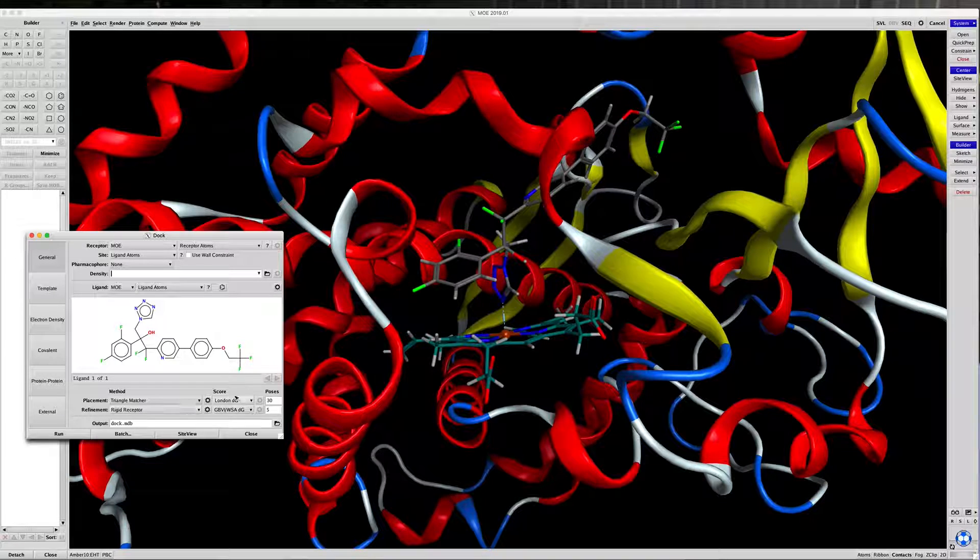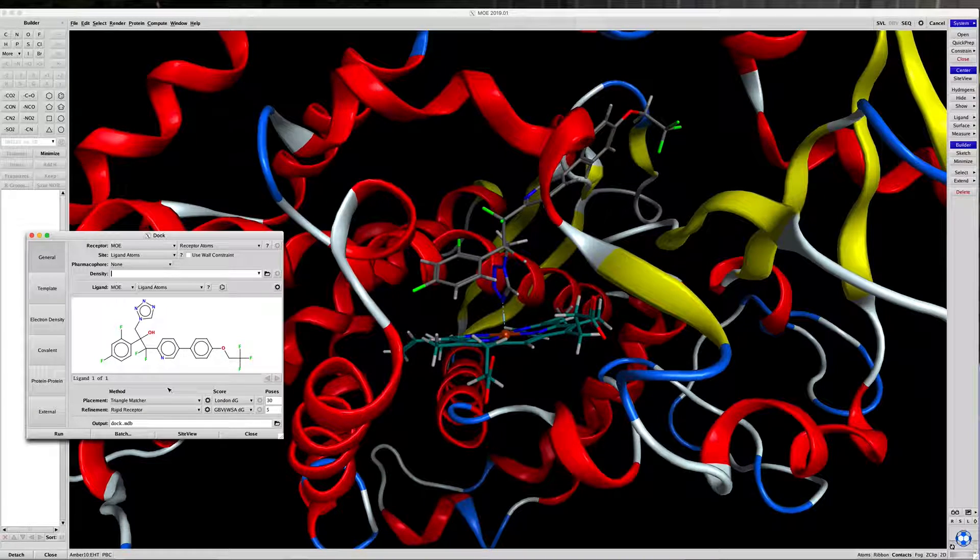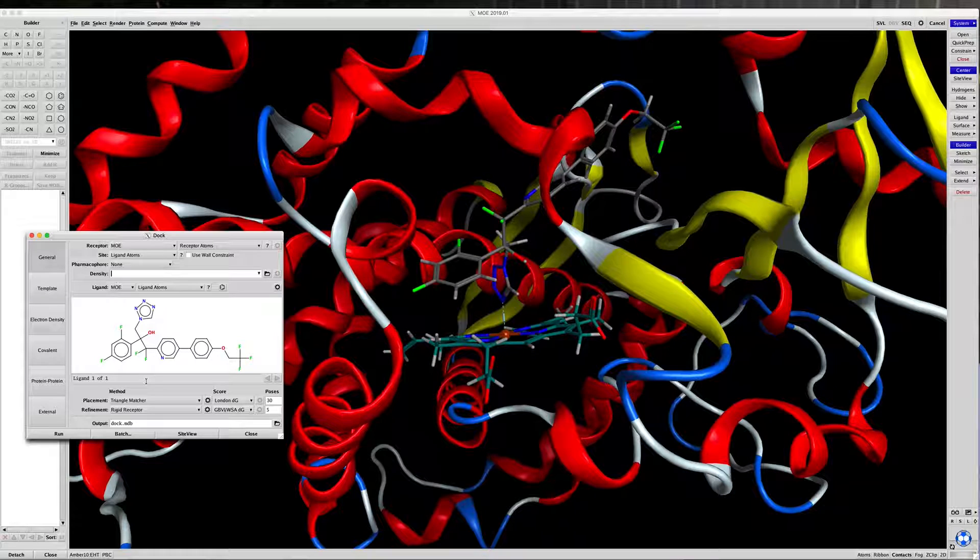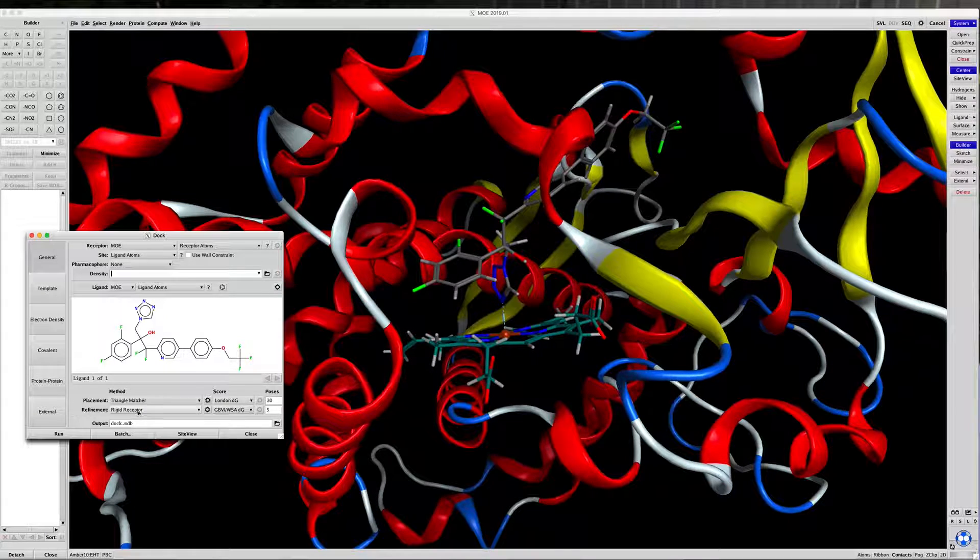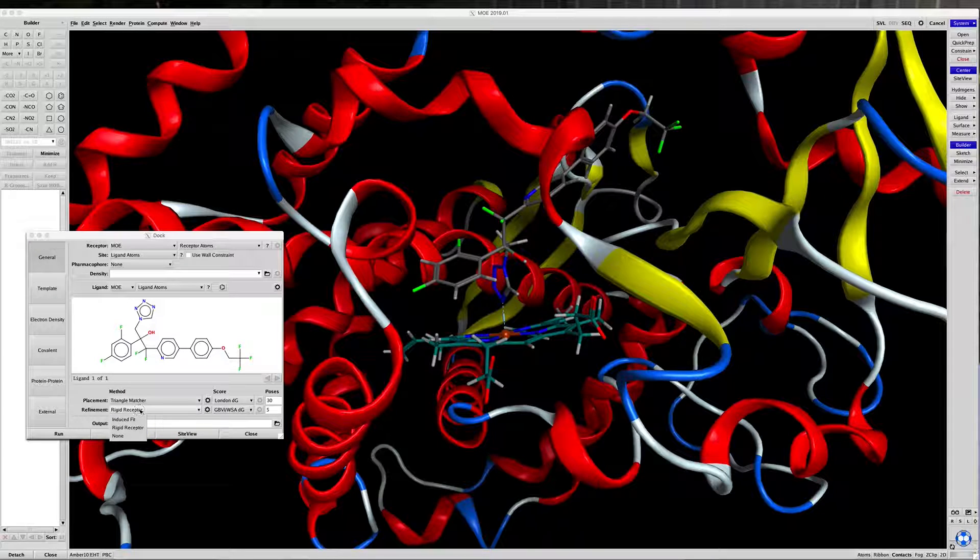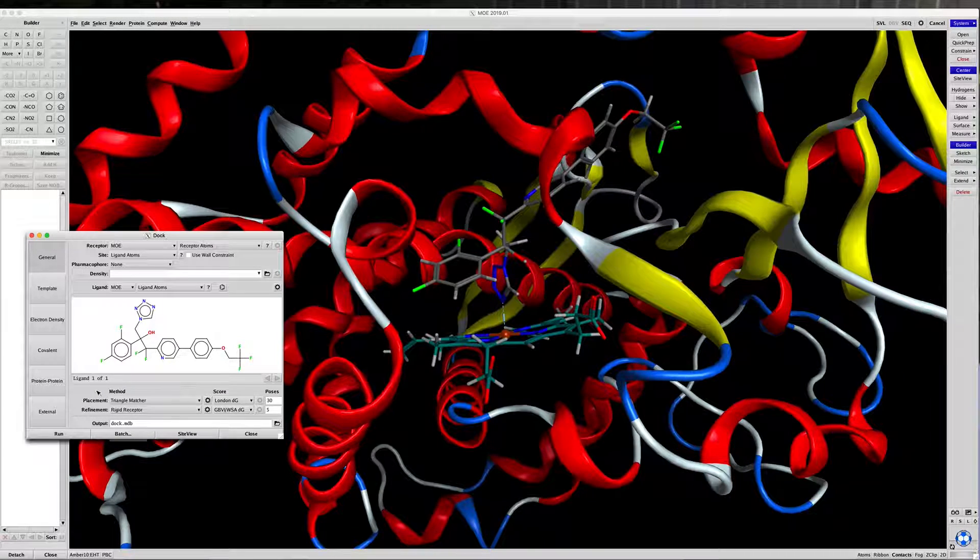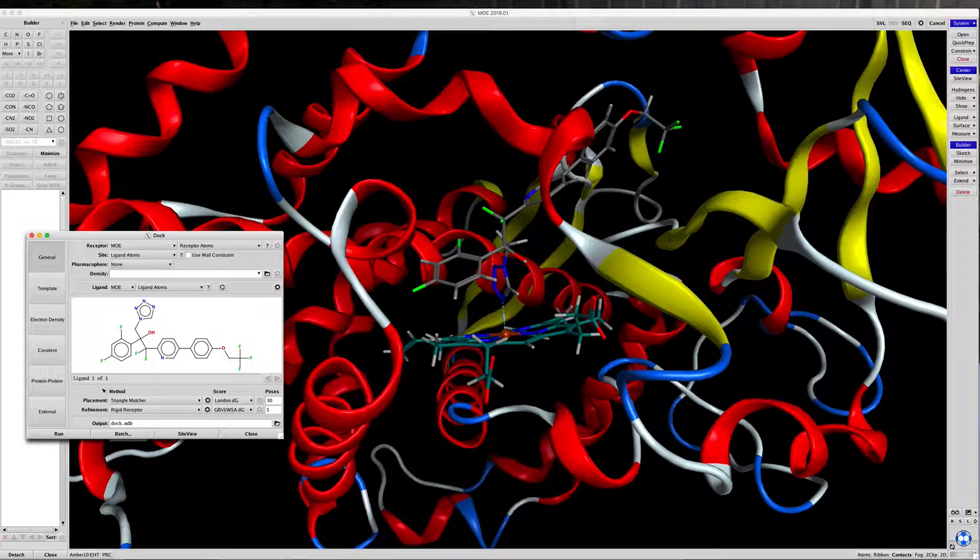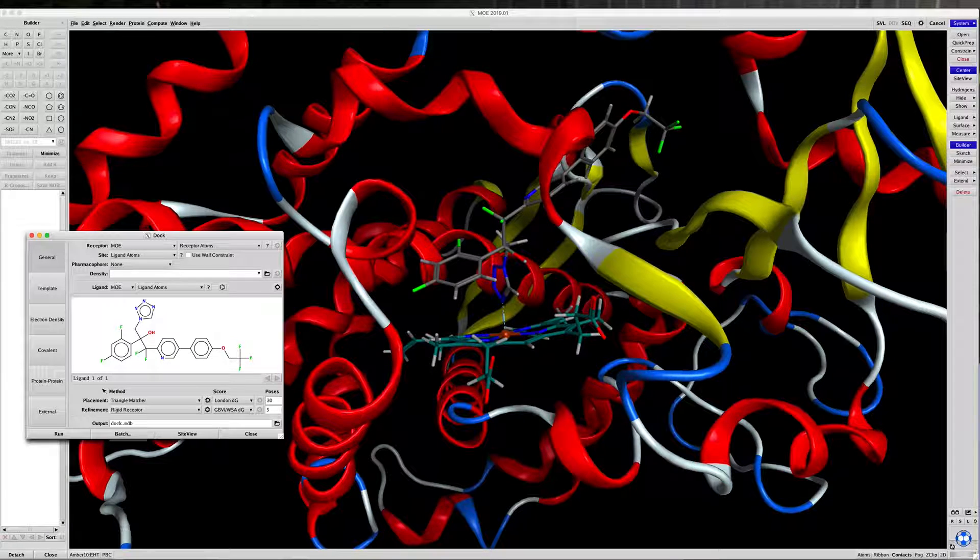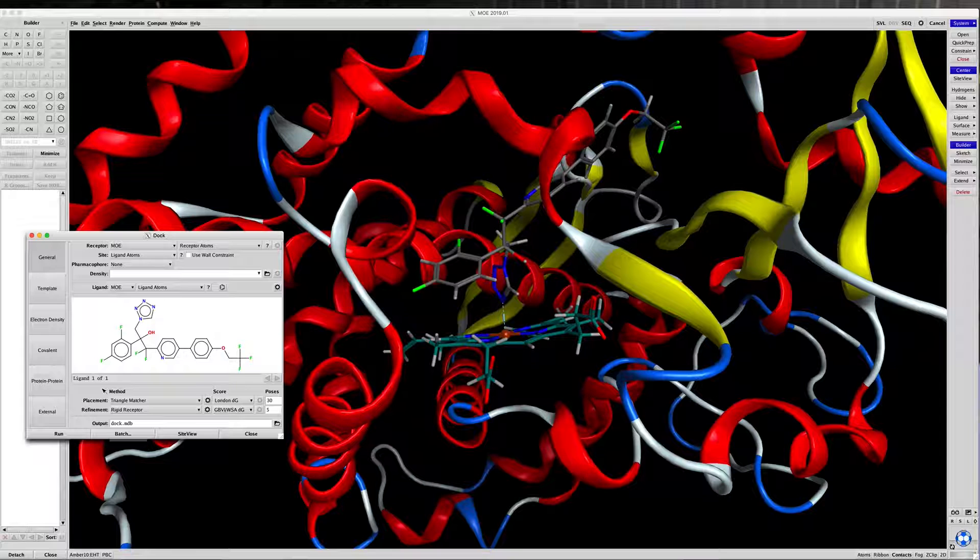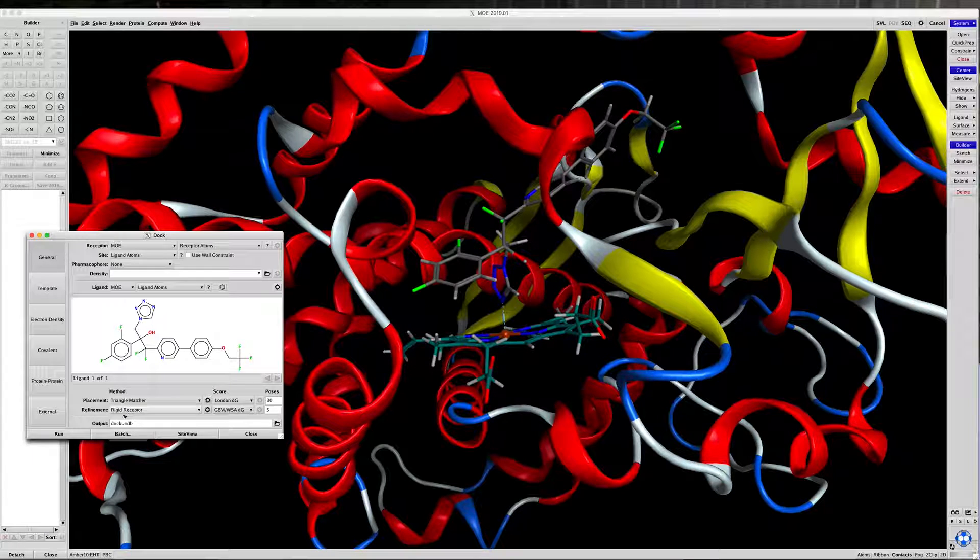I would suggest everybody just take a look at that, play with those things, see what works best, what doesn't work best. I would also have you take a look at using Induce Fit for refinement. What that does is it allows the receptor itself to move instead of holding it in a rigid form.